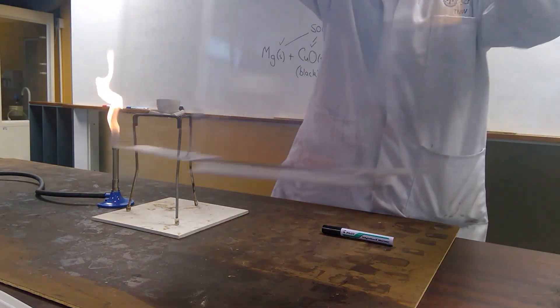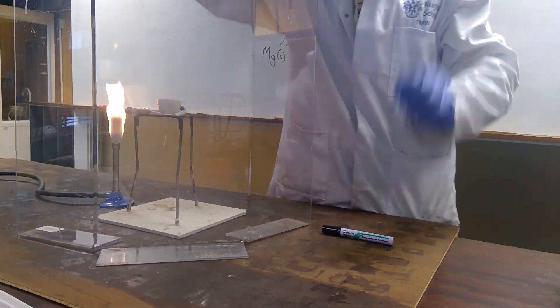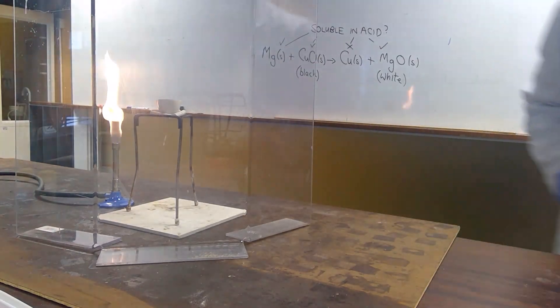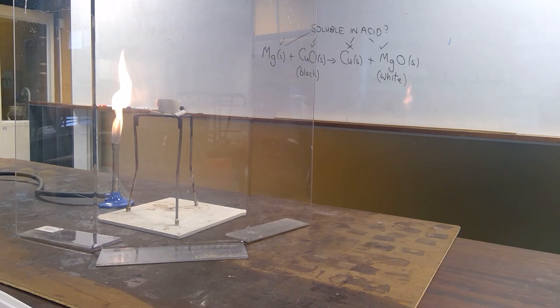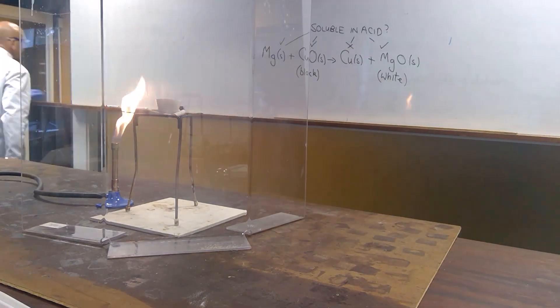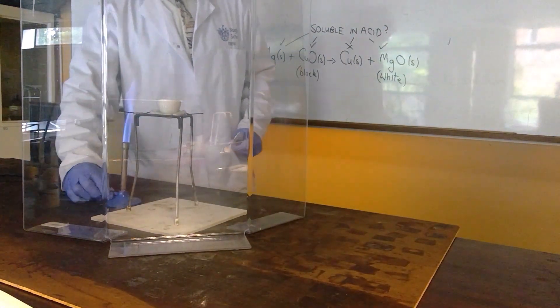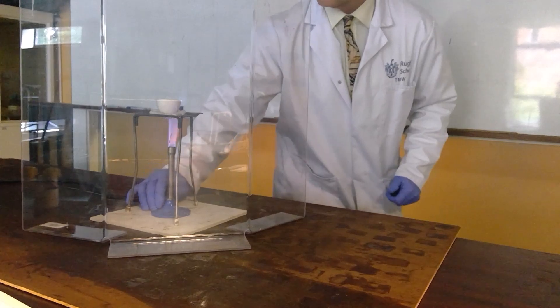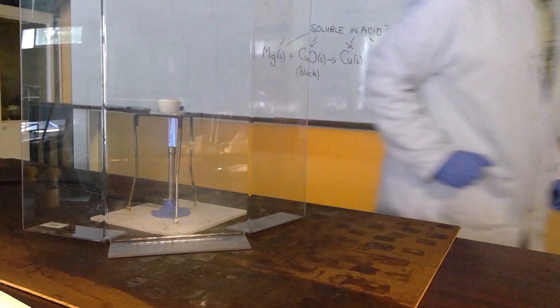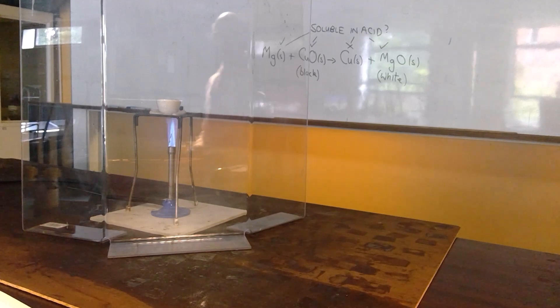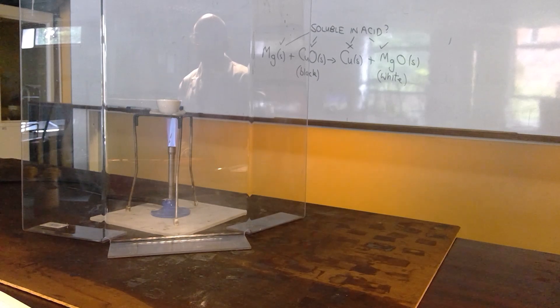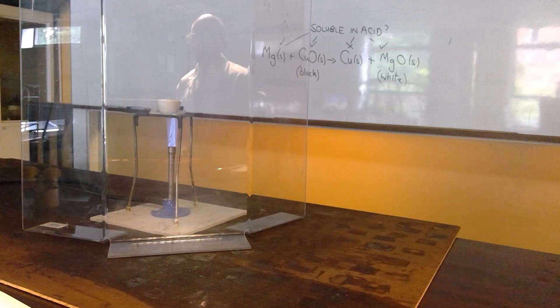The reaction can be exothermic, and so I will place a safety screen between myself and the reaction. It is not an immediate reaction — it takes a little bit of time for the energy of the particles to become large enough for the chemical reaction to occur. So there may be some delay before we see any sort of reaction.